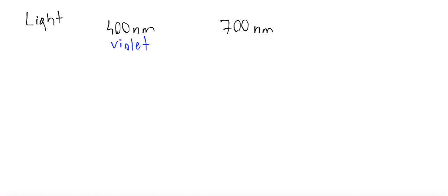Okay, a few more words about light. How do we know that light limits our resolution? As I said at the very beginning, visible light is an electromagnetic wave of wavelengths in the range from around 400 nanometers up to 700 nanometers, which corresponds to violet or blue light up to red light. So basically, if you have a rainbow, you can observe colors, yes?